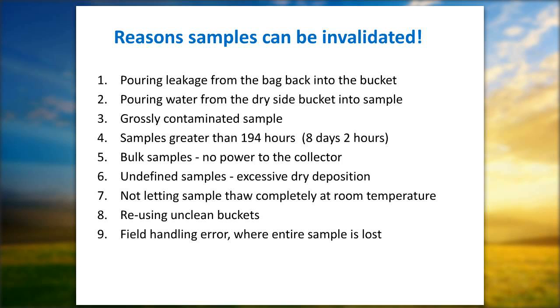Yeah, one of the rules that we have is that you try to get it sent off to us within a 48-hour period. I got a question from an operator yesterday as to, am I unmuted? Okay, my apologies once again. On number 7, 48 hours after the sample comes off, we ask that you have it in transit, in process within the 48 hours. So letting it thaw at room temperature for a day or so will allow you to do it. If, like Chris said, you're pressed for time or something like that, then do the best you can.